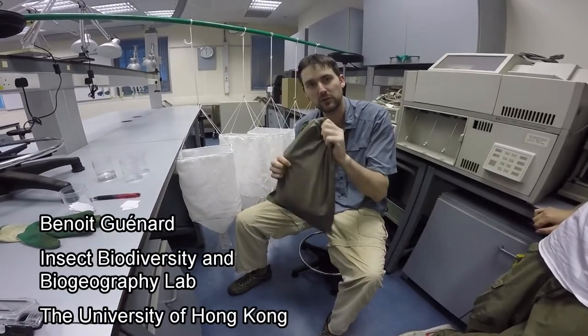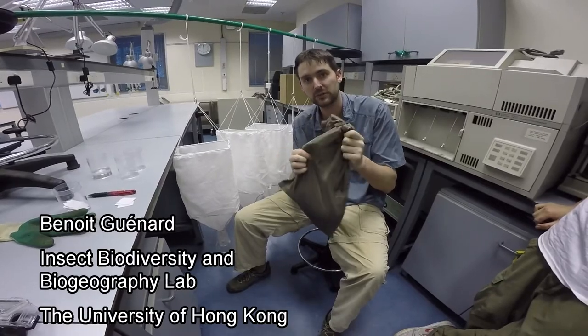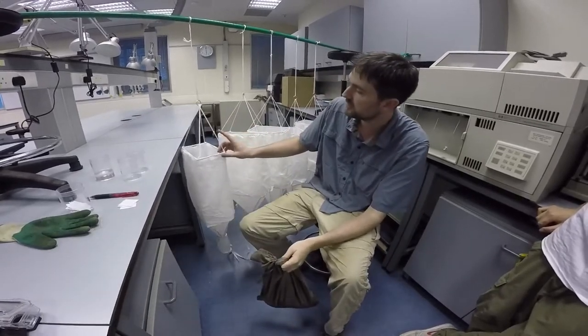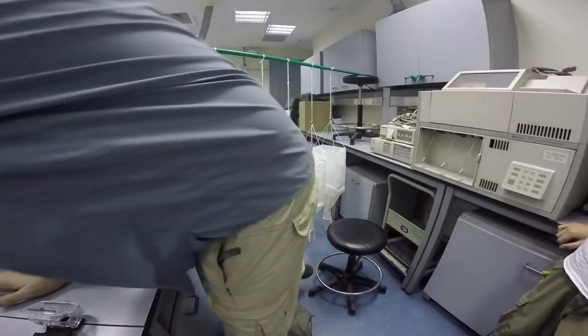Today we're going to do the second step for preparing Winkler bags, and that's the transfer of the sifted leaf litter, which is right now in this bag, into the white bag on which the leaf litter will be drying. To do that, we have a few steps.